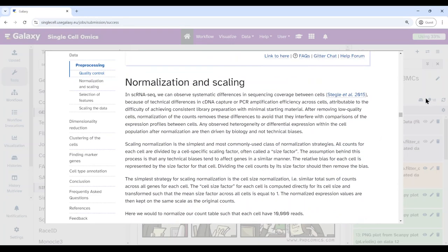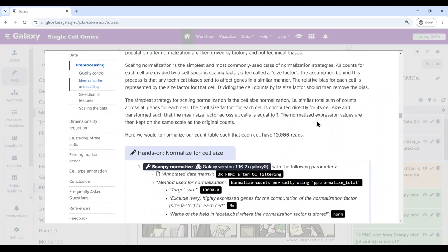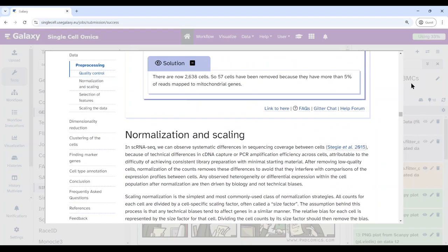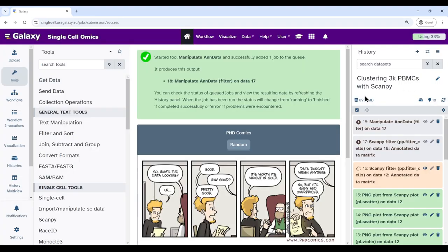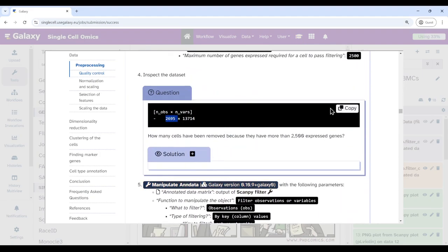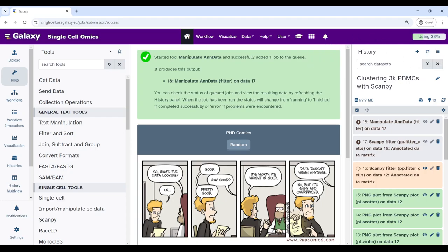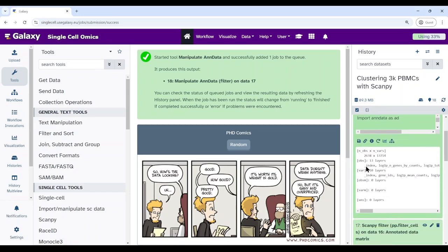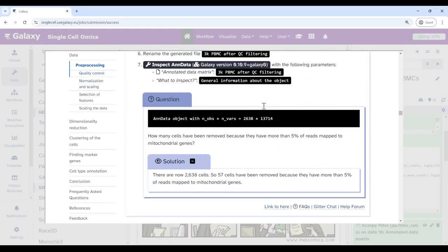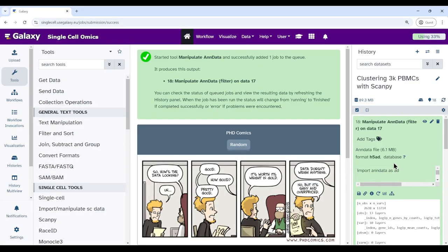Now we continue to normalization and scaling. Wait until the jobs are finished, then check you got 2,638 cells — the same number as in the tutorial. This confirms the filtering went well. Now let's go to the next step: normalization and scaling.